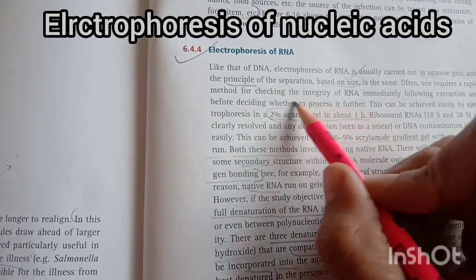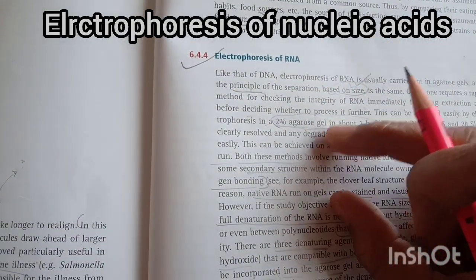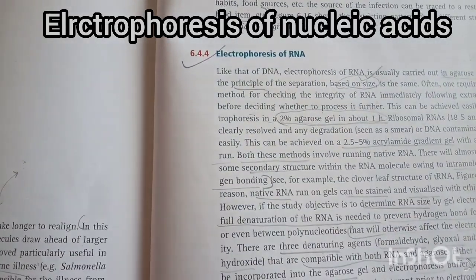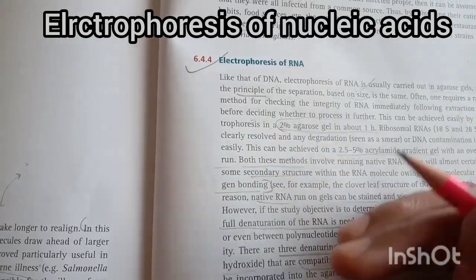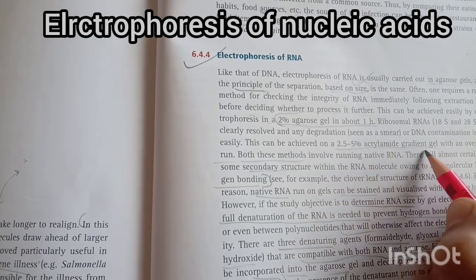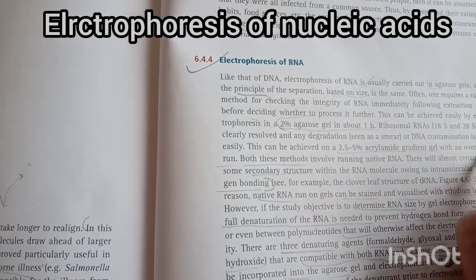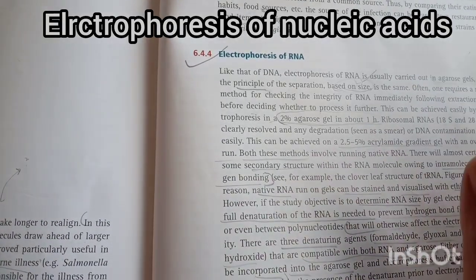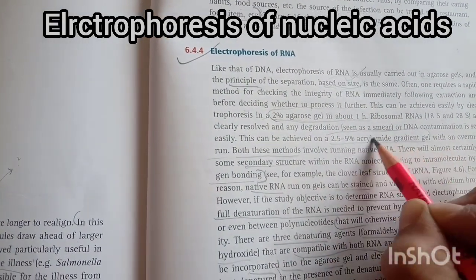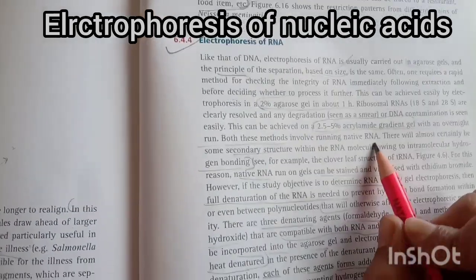So if we use this, we can easily analyze the contamination of any fragments, any protein fragment, or we can say DNA contamination can be easily visualized. This can also be achieved on an acrylamide gradient gel of approximately 2.5 to 5% with an overnight run. Okay, 1 day.